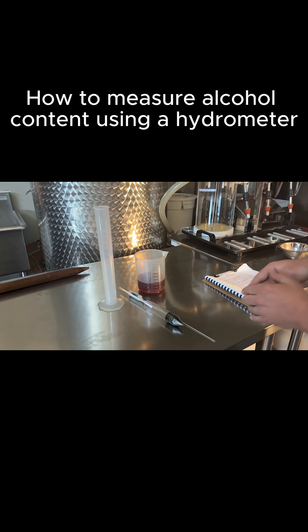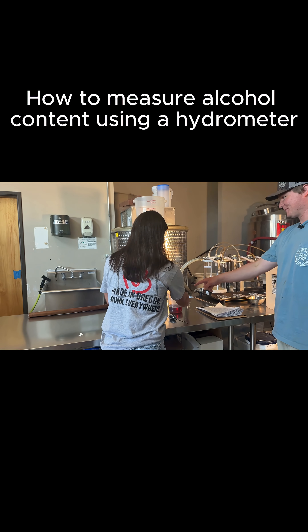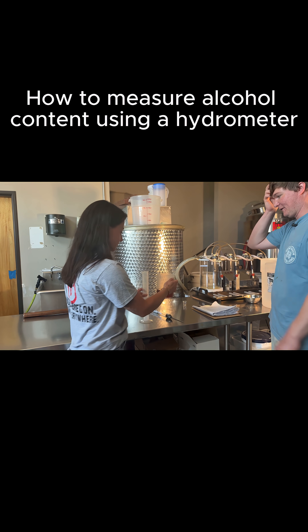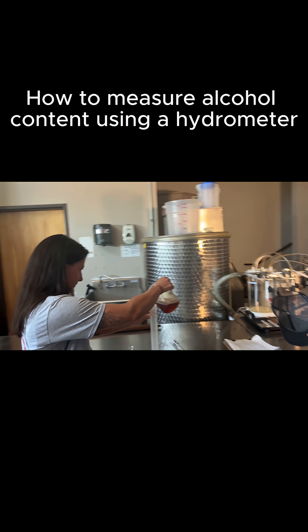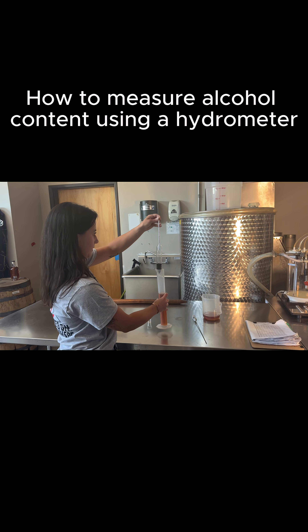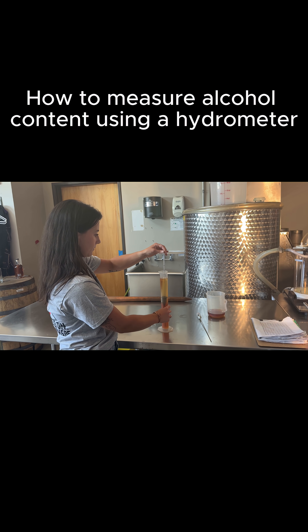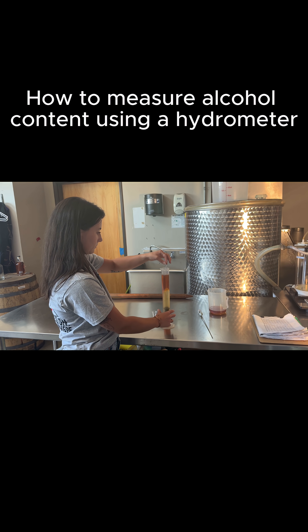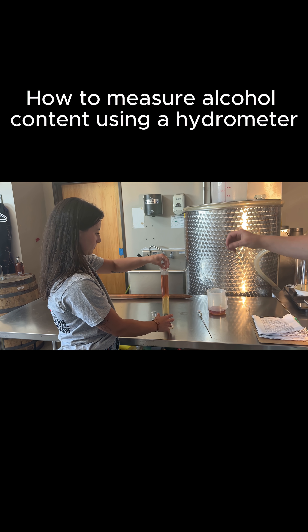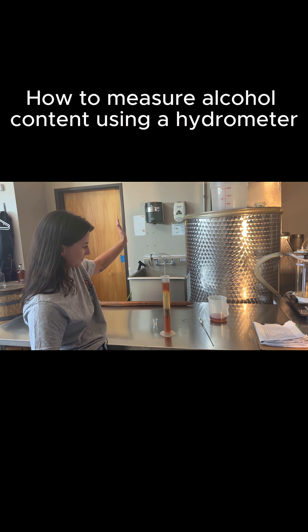What we really need to know is wherever it lands — we'll get a reading, grab the temperature, and then we'll proof it out. Fill it to about here because we need to leave a little room for the hydrometer. Dip it down and back up just to get it to coat the whole thing, then give it a little spin and let it go. We'll wait till it settles out.